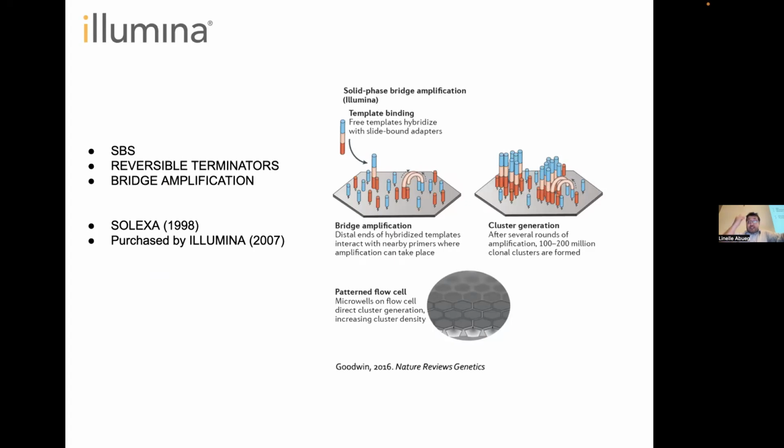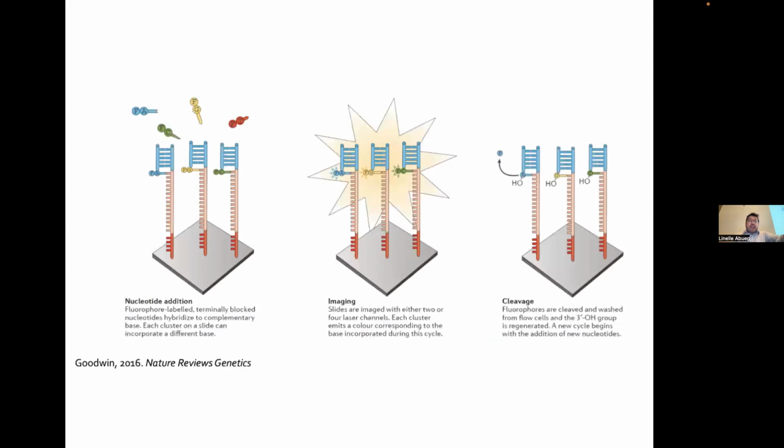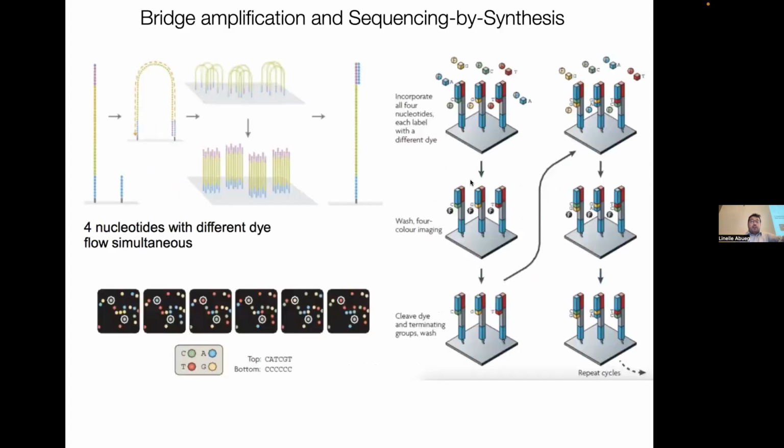So Illumina approaches Solexa, 98, and again, bridge amplification. And the sequencing, as I was saying, you incorporate a nucleotide of different colors every time. And you cleave the termination, and you incorporate another one. You cleave the termination, incorporate another one. So all you end up having is this cartoon on the bottom of your page where you see these colors blinking. And actually you see that on the screen. Blinking for each incorporation, each cycle, they call it.